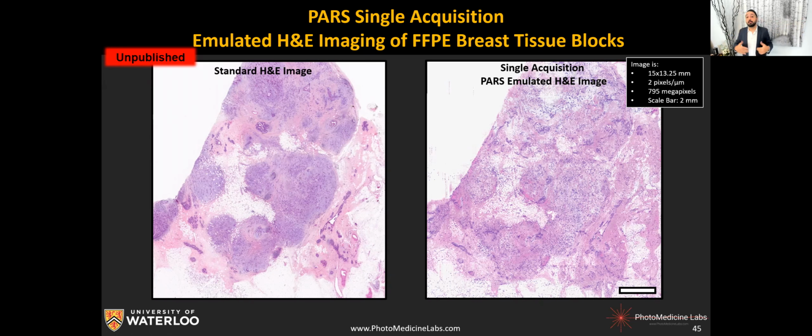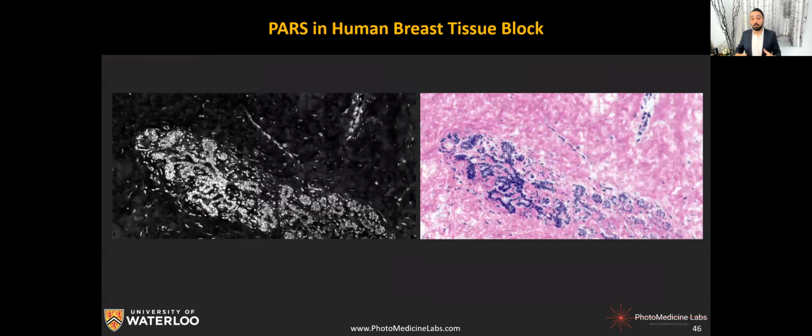And to me, this is very exciting because we're really coming to this quality that we may actually now skip the glass slide and directly image unstained paraffin embedded tissue block. And anyone who works in optics can relate to how difficult it is to focus and collect information within paraffin, because paraffin is also absorbing light and is super scattering. So if we can do that, and we can actually get H&E-like images, again, by taking advantage of both the scattering and absorption, this really matters.